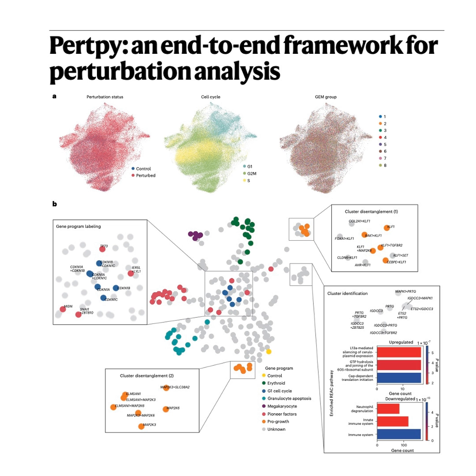Let's do another quick recap before we get into the case studies. Sounds good. So we've moved from data prep to analysis. A huge concept here is takeaway number 4, the perturbation space, which summarizes the collective response of thousands of cells into a single representative point, or avatar, letting us see how different stimuli relate to each other. And for analyzing cell abundance, takeaway number 5 is that Pertpy is flexible. For labeled data, it uses Bayesian tools like scCODA, and for unlabeled or continuous data, it uses the graph-based tool Milo. Finally, takeaway number 6. To quantify the effects, Pertpy offers over 18 different distance metrics, from simple MSE to complex ones like Wasserstein distance, and all of them can be rigorously tested for statistical significance.